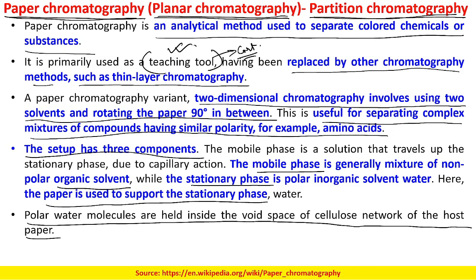If you are not, paper chromatography gives you an indication of what you should be expecting from your analytes. That would be the first step to understand how your analyte system or samples may be behaving.